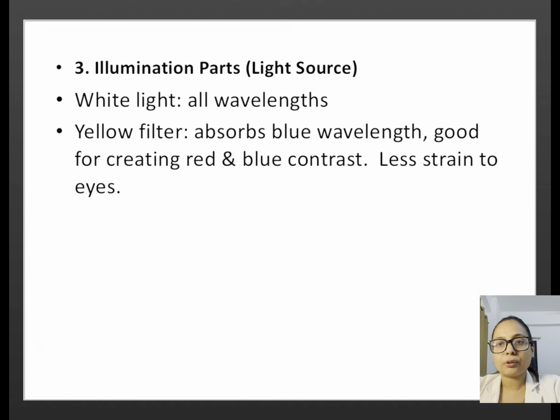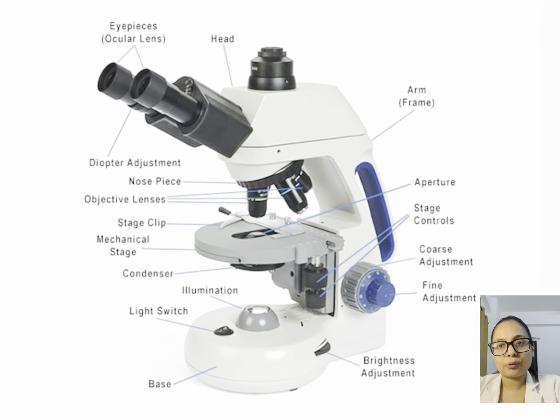Now, residents, it depends on you whether you want to buy a microscope with white light or a microscope with yellow light, but yellow light will definitely give you good contrast. The microscope I am using currently has a white light.